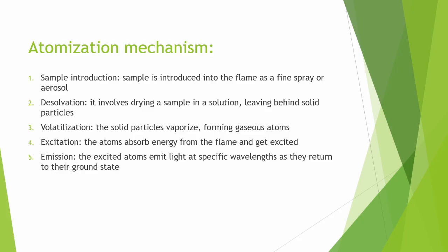It involves several key steps. First, the sample is introduced into the flame as a fine spray or an aerosol. Then the solvent evaporates, leaving some solid particles. This is called desolvation. And the third one is volatilization. In this, the solid particles vaporize, forming gaseous atoms.